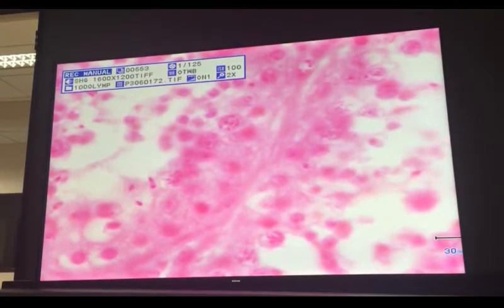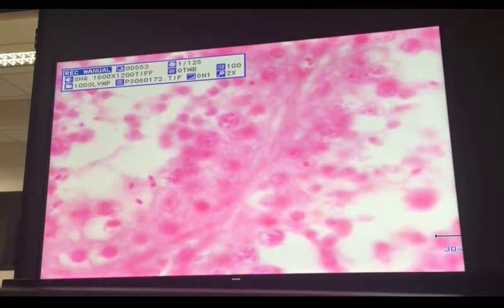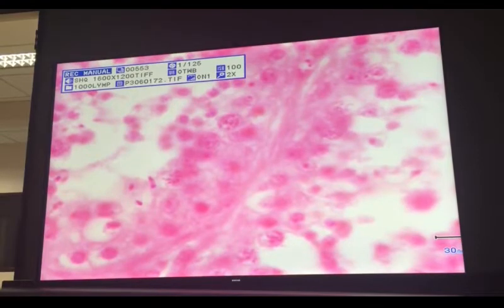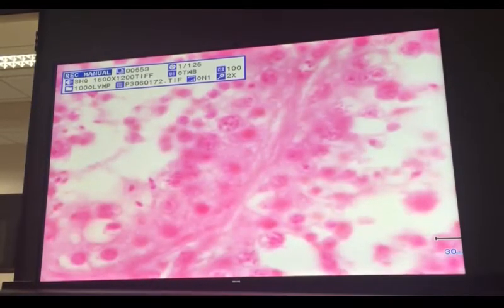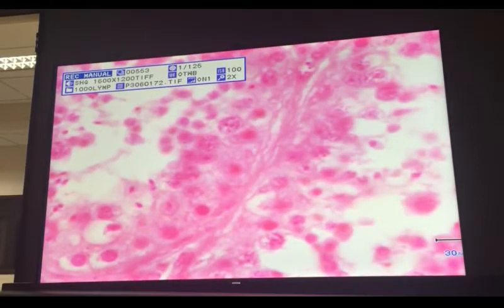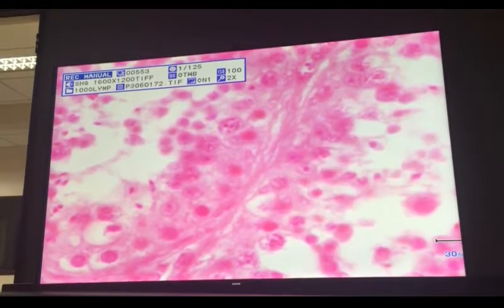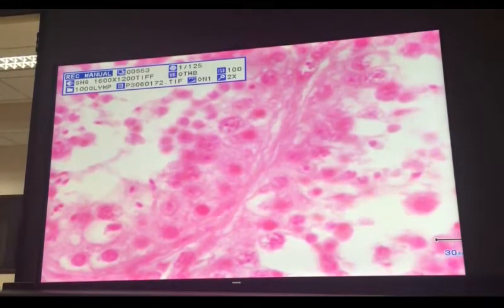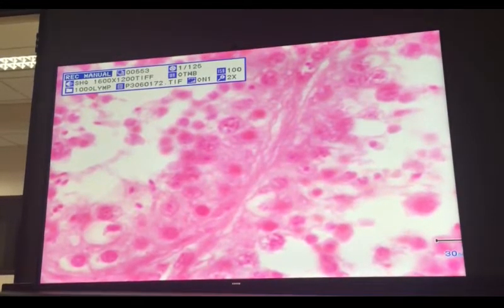Okay, primary. There are two types of spermatocytes. Primary. So those cells which are much larger than the other cells inside the tubules are called primary spermatocytes. Pinakamalaki sila sa spermatogenic cells. So primary spermatocytes, that layer pointed. And then immediately above the primary spermatocytes are, second.